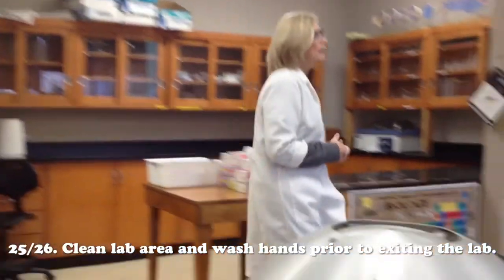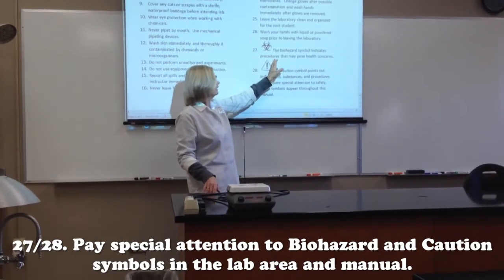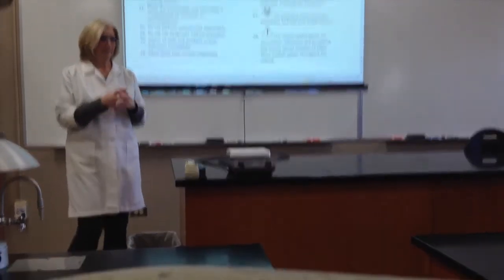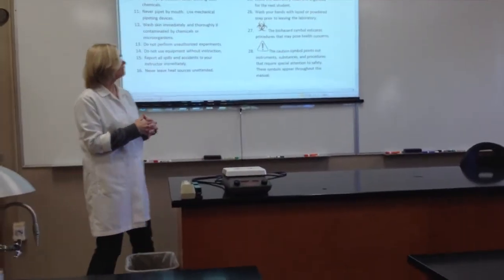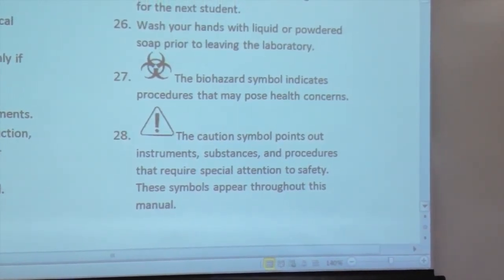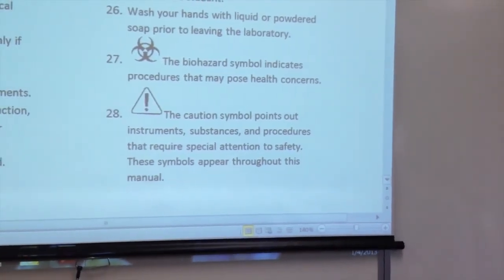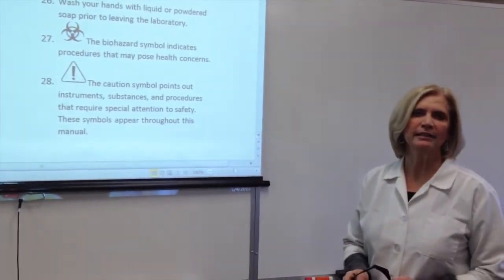And then finally, we are introducing to you a biohazard symbol. When you're reading the document, you'll see this biohazard symbol, which indicates that the material associated with this may cause a health concern, and the bag that's associated with disposal of that is typically a bright orange-red color. We will point that out in the lab when we have that available. And then lastly, we have the triangle with the exclamation point. It's simply a caution symbol to bring attention to safety, that this material may require a bit more focus. And we would indeed point this out again in lab from your instructor so that you stay safe.